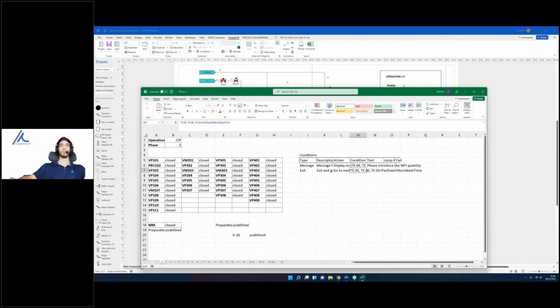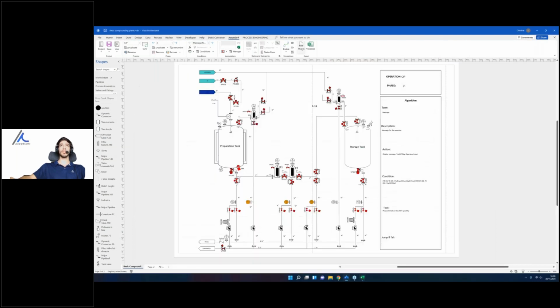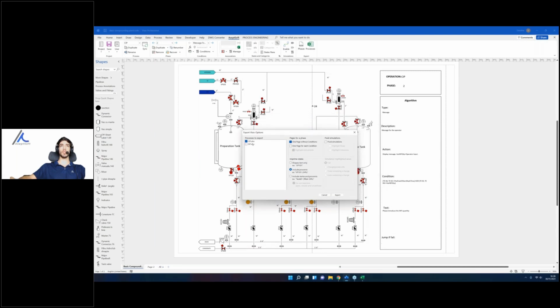There is no problem. Now let's see the export of the process. So all we have to do is press the export button. And now you see the processes that we are able to export. We can go for conditions customizations. We want to have the conditions in the process in the export or not. I'm going to opt for them.